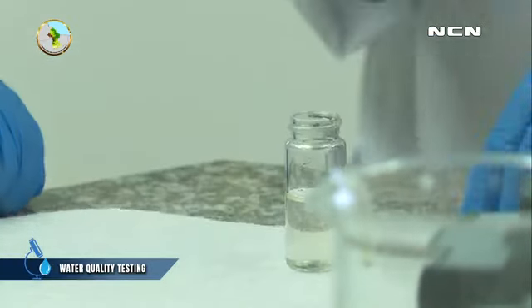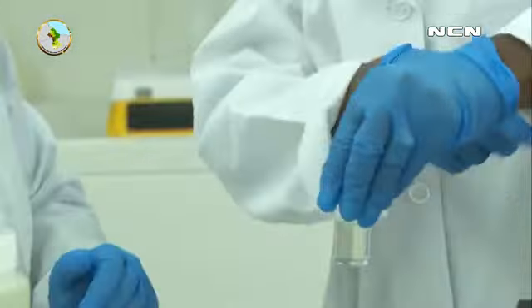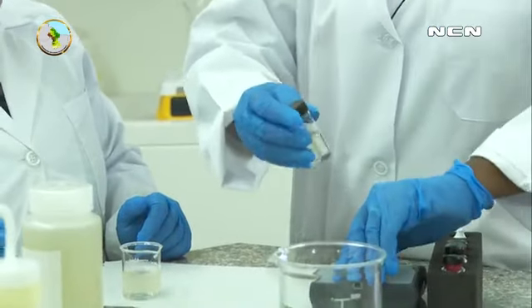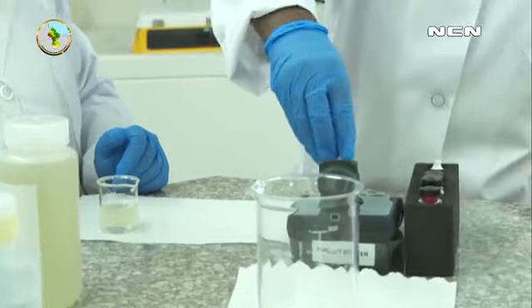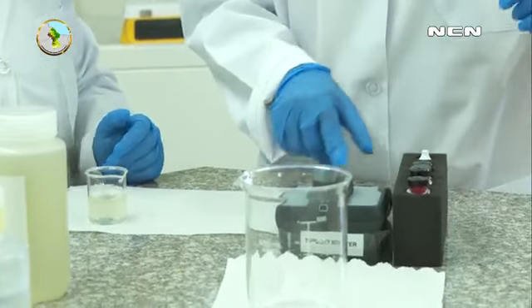Okay. Because when you put the sample cell into the meter, the sample reaches exactly where the light will be penetrating. So now we will turn our sample. We'll make sure the number is at the front, put it in, and then you're going to press read.